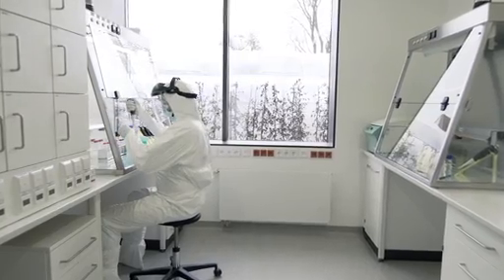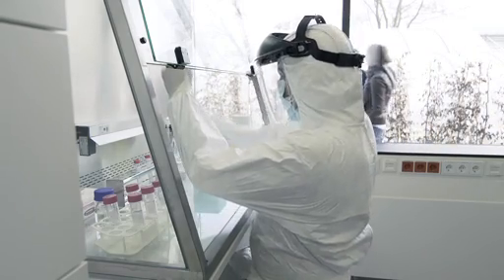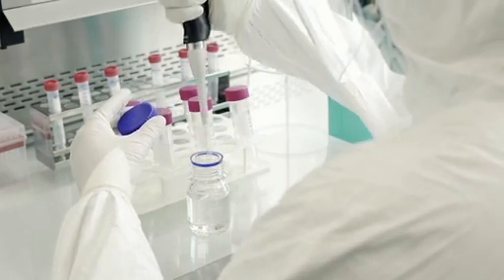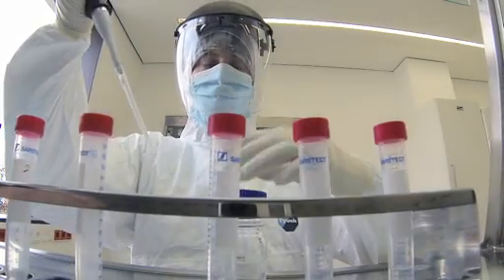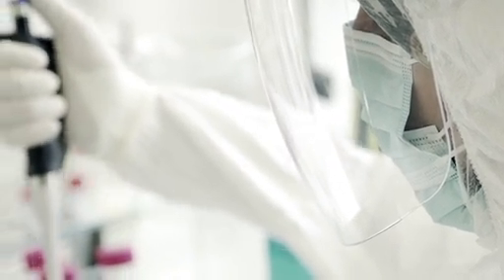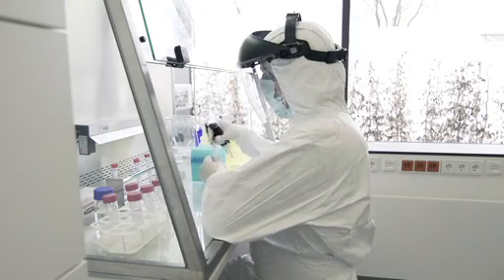Now we're in the heart of the lab, where the DNA is extracted from the sample. Nobody is allowed to move around while somebody is working in here. We try to avoid producing any turbulence. We actually turn off the air circulation while the pipetting is being done, and we extract the fumes after the work is done and the reaction tubes are closed.